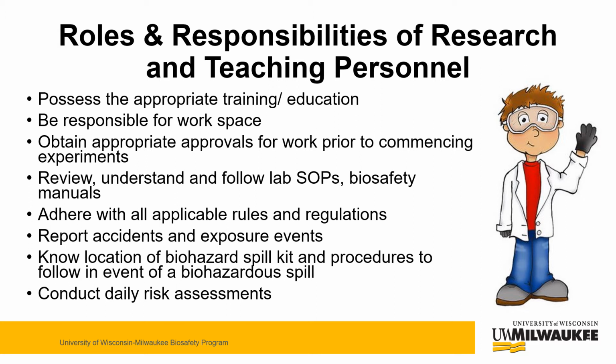You need to make sure that you are regularly reviewing, understanding, and following all laboratory standard operating procedures and biosafety manuals. It is your responsibility to adhere with local, state, and federal guidelines and regulations regarding biohazardous materials. Report any unsafe practices or near misses, as well as any accidents and exposure events that involve biohazardous materials.